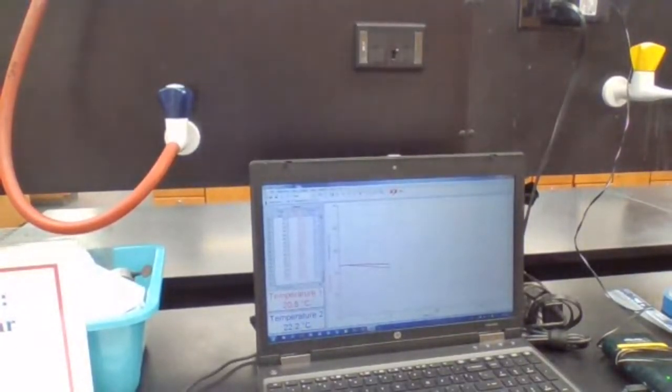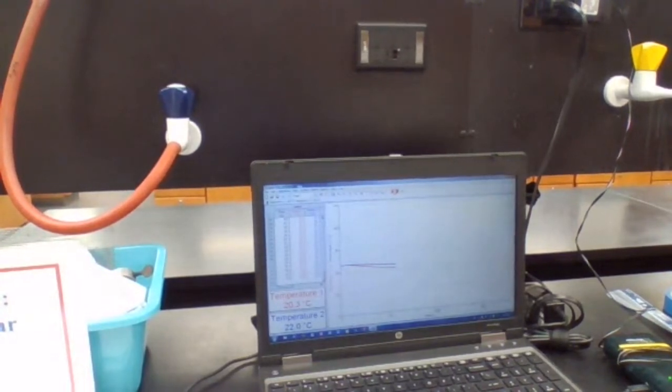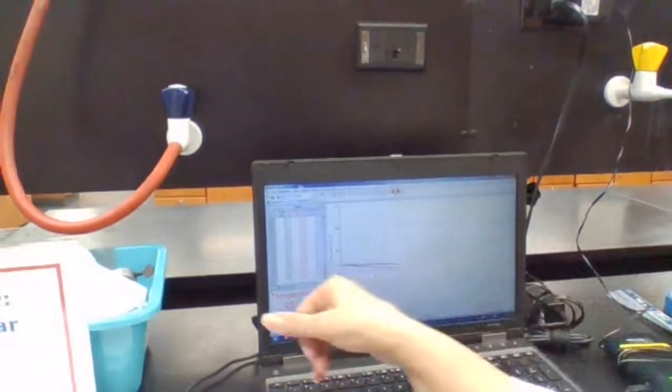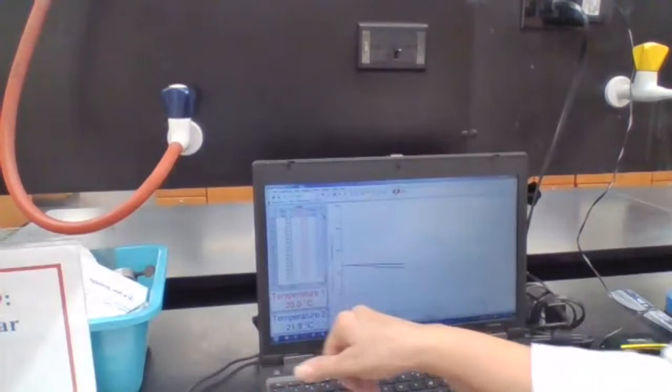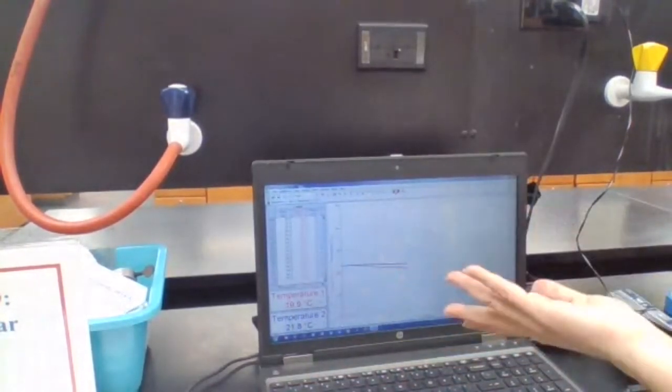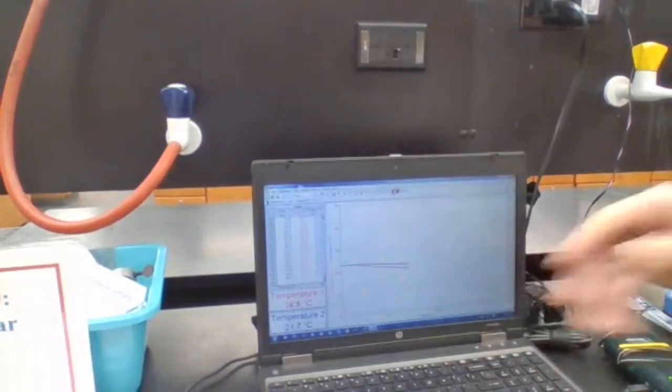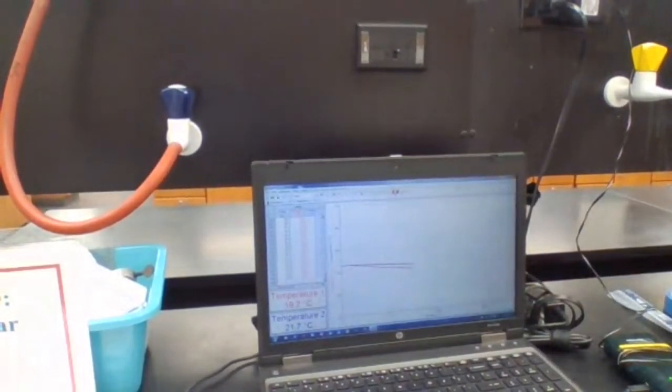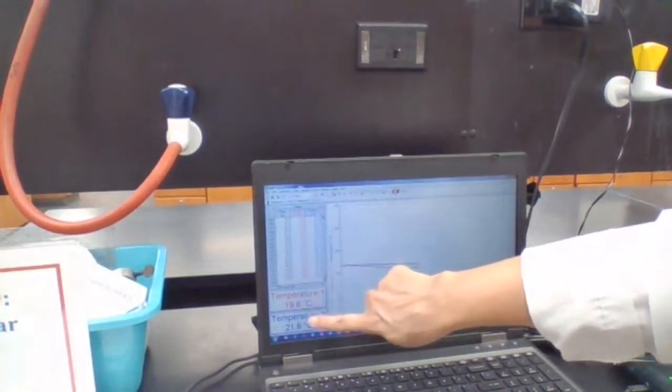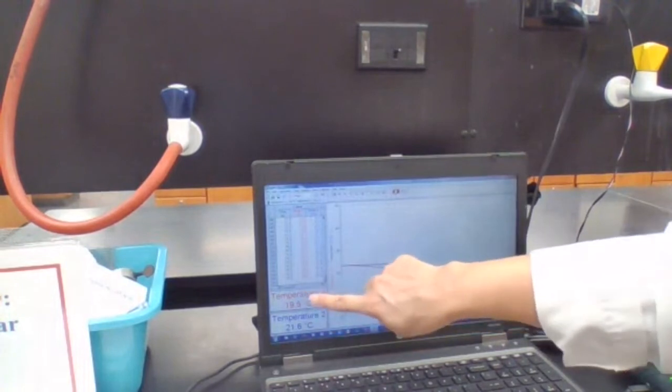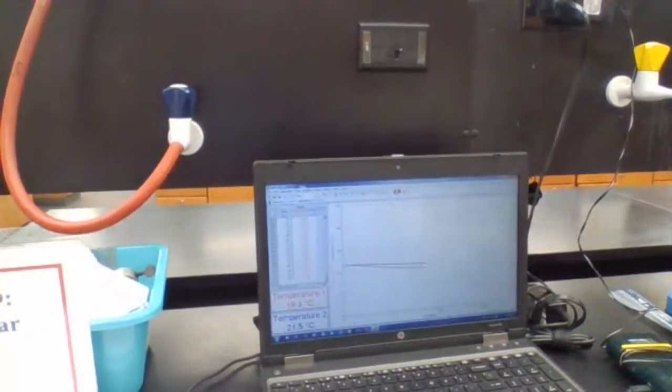Both of them start with 23.1. Now propanol is 20.2, but butanol is 21.9. It has not reached plateau. I'm not ready to stop yet. I'm waiting for the temperature to reach plateau, but I'm just saying the change in temperature for propanol is more significant than butanol because propanol is a lighter molecule. It has three carbons. Butanol has four carbons.